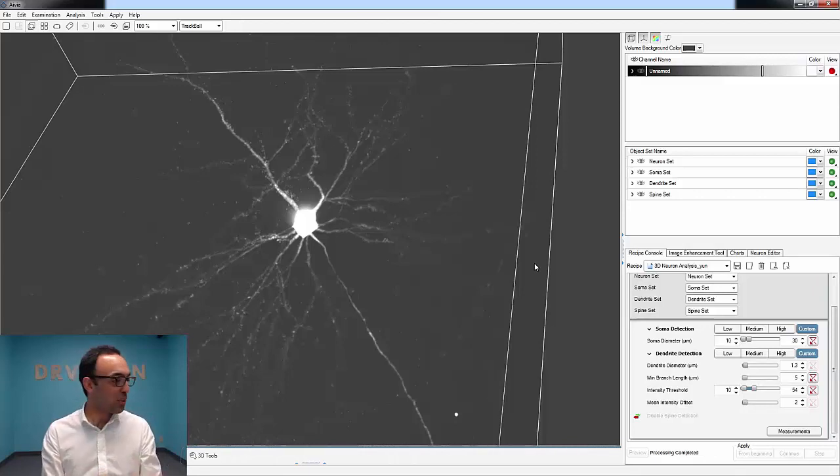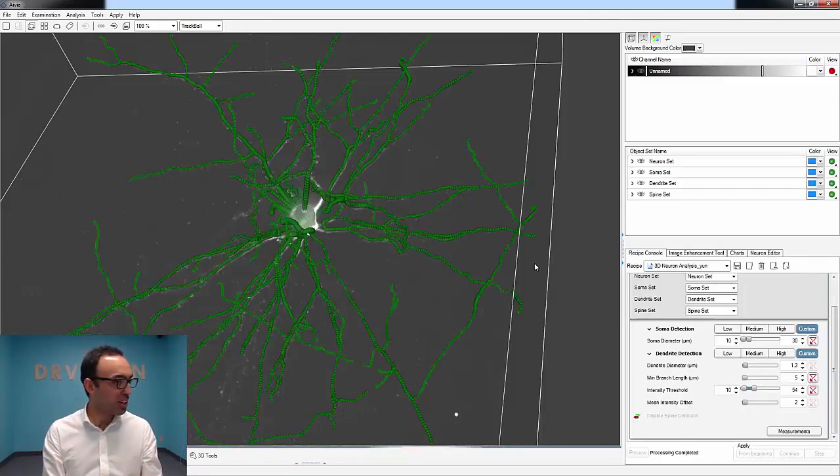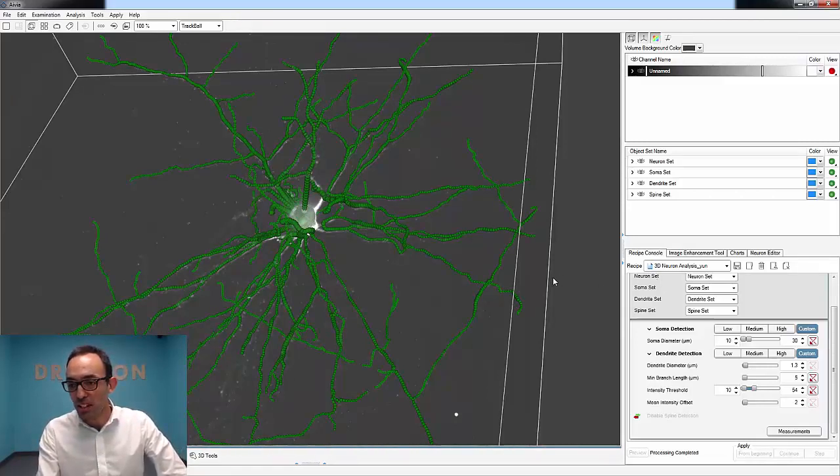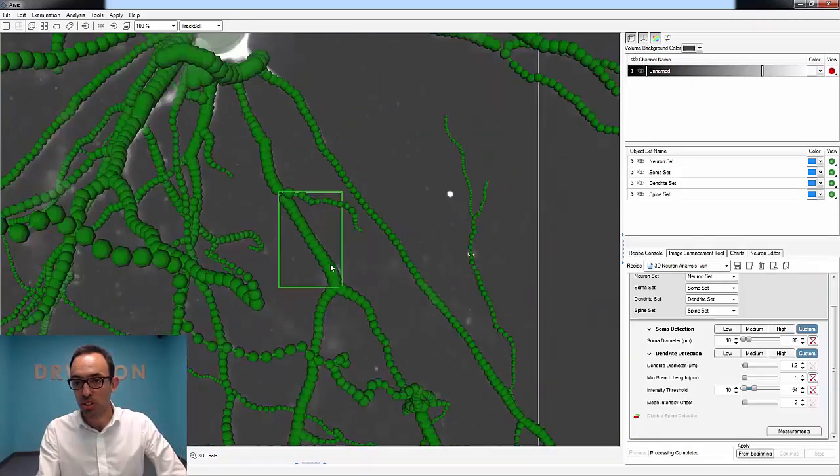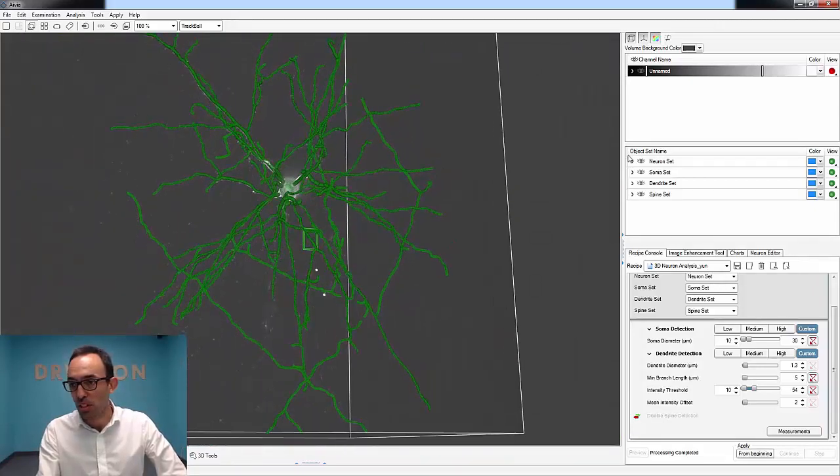So I don't know if there's any question I could answer right now. Is there anything? Currently not any questions. Nothing? Okay, good. So the analysis has been completed, and now the rendering is happening, and it's already completed as well. So we can already start to explore the results. So let me show you.